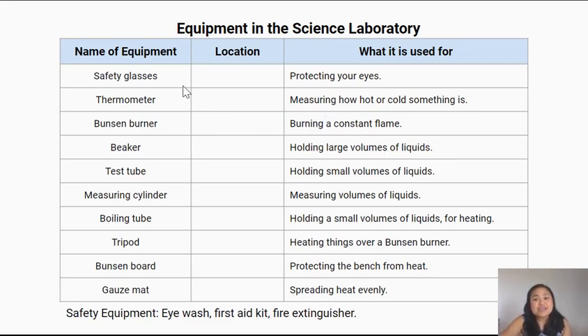Safety glasses are used for protecting your eyes. Thermometers are used for measuring how hot or cold something is. This Bunsen burner that we'll be learning more about today is used for burning a constant flame. Beakers are used for holding large volumes of liquids, while test tubes are used for holding small volumes of liquids. A measuring cylinder measures volumes of liquids — how much liquid have you got? This boiling tube is used for holding small volumes of liquids for heating.